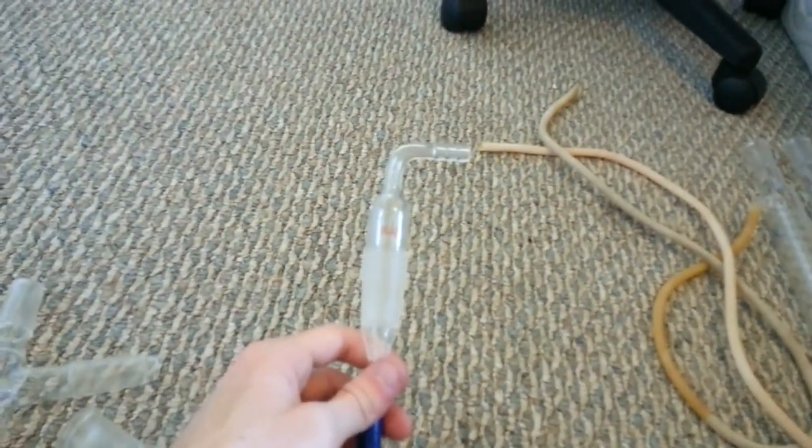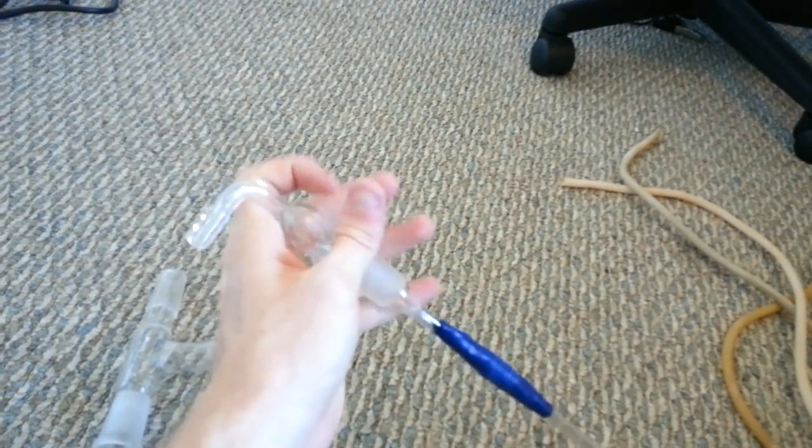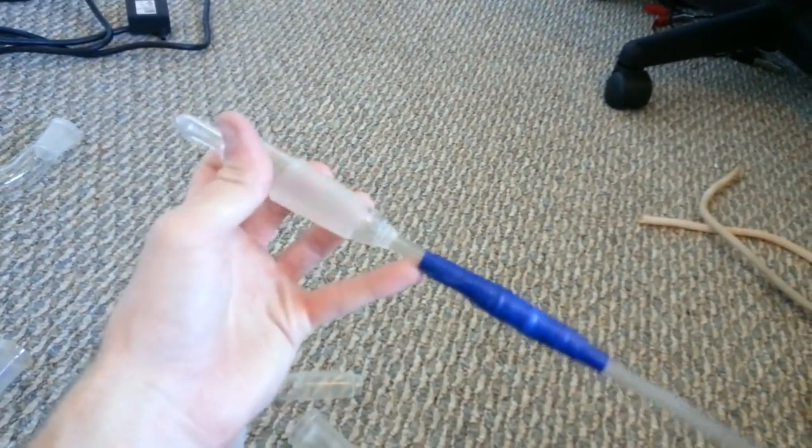Electrical tape — you should get some of that. You can hook a tube up to this adapter and it'll bubble gas down the tube into a flask. It's also really good as a sort of turkey baster-type thing: you just put it into liquid, close the top, and you can pull the liquid out and dump a little bit into something. Its primary purpose is for gases.